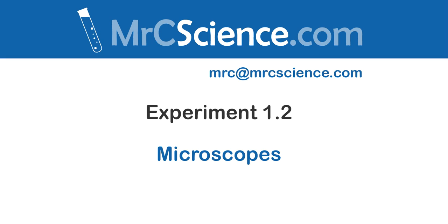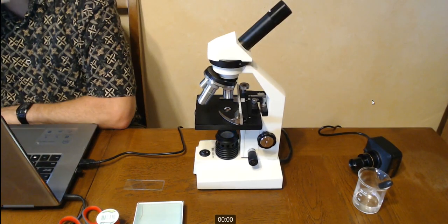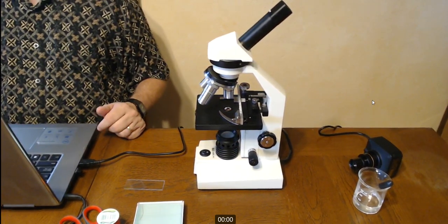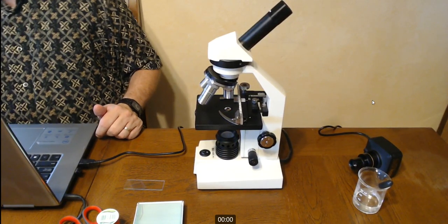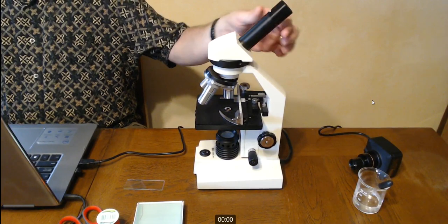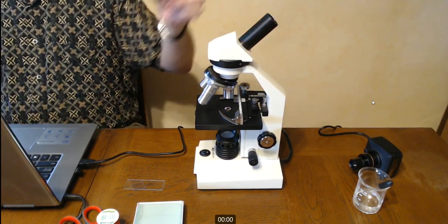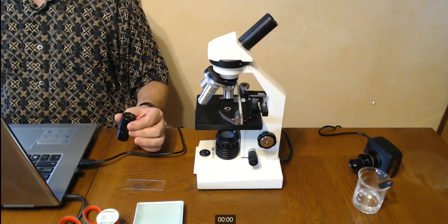So let's take a look at our microscope. Here I have a standard microscope. We're going to go through the different parts first. If you want to follow along, I'm on page 30 of the biology textbook. At the very top is the eyepiece, the portion that you look through. My eyepiece comes off because I have a microscope camera here that I'm going to use to show what we're looking at.